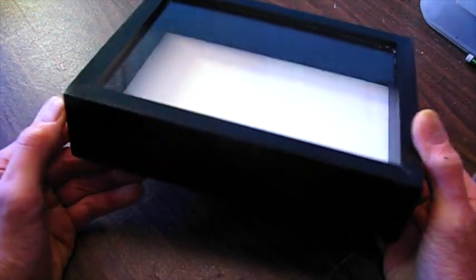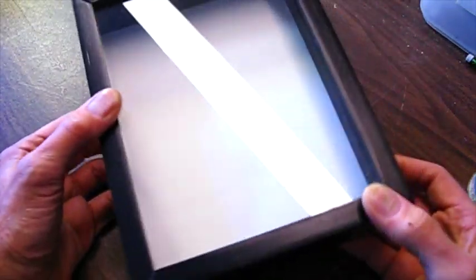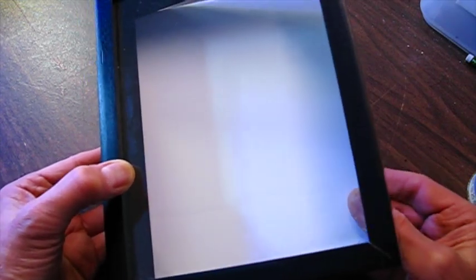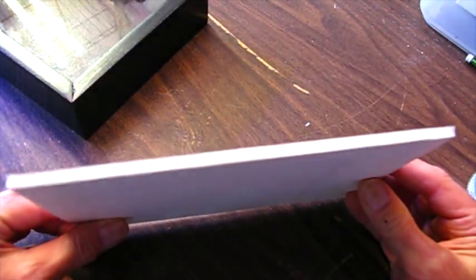This is a frame actually that I made years ago, and I'm going to put some butterflies in these for someone I know. I use a foam core on the bottom. It's paper with foam in the core, and this works really good for pinning the specimens too. And it fits into the back of the box. There's a groove here so it fits in nicely. And I think this makes for a good display.